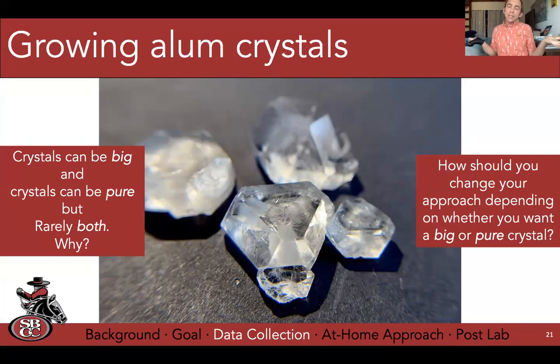Well, so what would be this trick, do you think, to growing a big crystal based on what I just shared with you and showed you on me growing what I would say is a big crystal? Saturation. So somebody said something about saturation. That's good. More saturated solution. More saturated, but I told you that I can continue to push my solution saturation higher and higher and higher using that microwave technique, right?